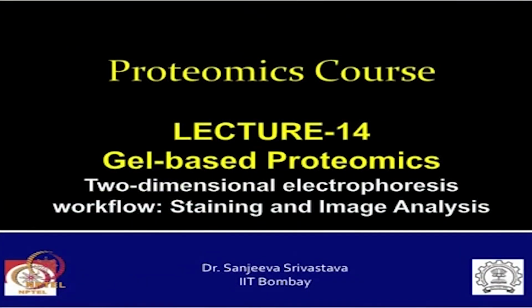We started discussing the workflow of how to perform two-dimensional gel electrophoresis.